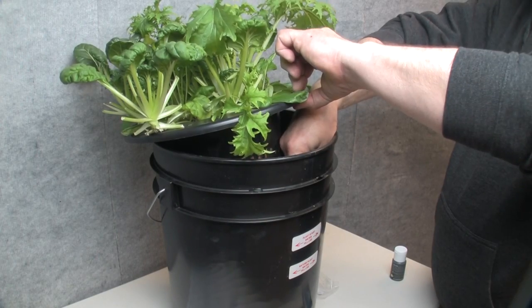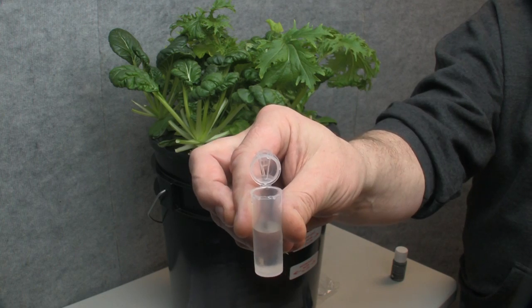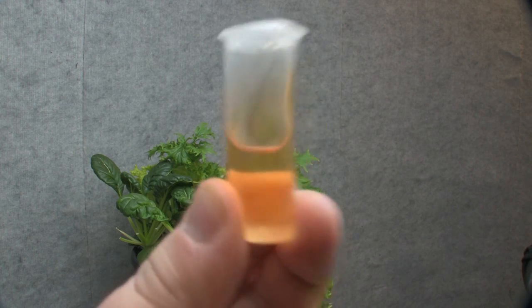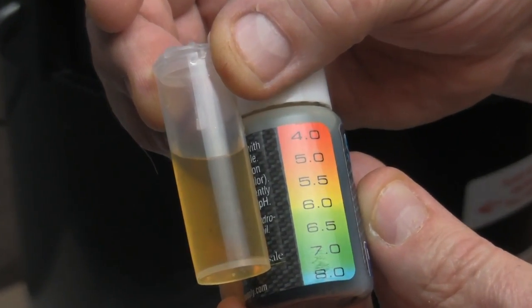To use the test kit, fill the test vial half to three quarters full with a clean, clear nutrient solution sample. Add two drops of pH indicator solution, close the cap on the test vial, and shake gently to mix. Then compare to the color chart on the solution bottle.